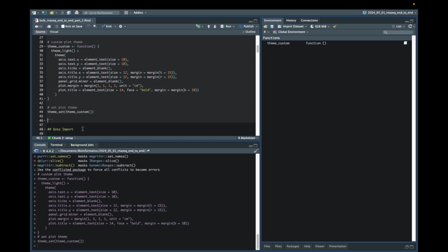Variables recorded in the experimental metadata will include things like cell line or patient IDs, the different control and experimental test groups to which the respective samples belong, the technical replicate number, and other variables like date of collection, to name a few. The importance of good metadata, amongst providing sample labels and enabling correct parameterization of the models and contrasts needed for statistical testing later, is that it should also record any potential confounding factors that we might need to address as part of our quality assessment.